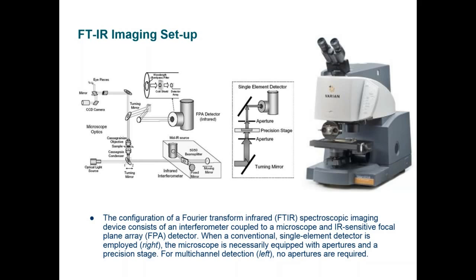Now, FTIR imaging is possible simply by using an optical microscope and an IR detector or IR setup to do single-point spectroscopy. However, in an imaging setup, one can use what we call a focal plane array detector, which, to make a long story short, is similar to technology found in military technology called the Stingray missile.